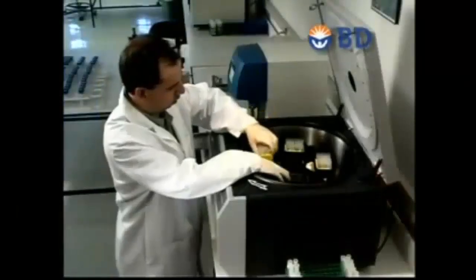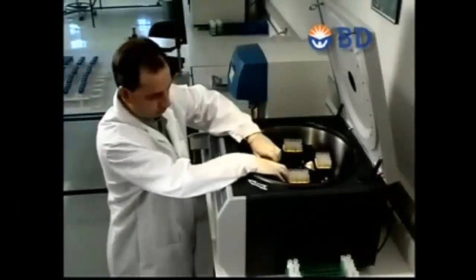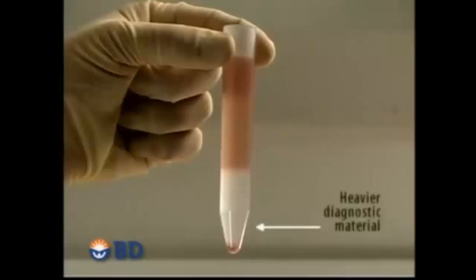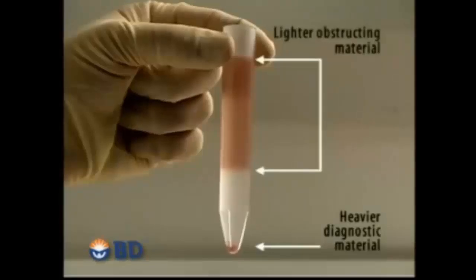With SurePath slides, there are 2 centrifuge cycles. The first, a soft spin, takes a little over 2 minutes. In this cycle, the density reagent sorts particles based on size, shape, and density. Heavier diagnostic material is allowed to pass through the gradient, settling to the bottom of the sample, while lighter red blood cells, mucus, and approximately 50% of the inflammatory cells remain trapped in the sample layer above.